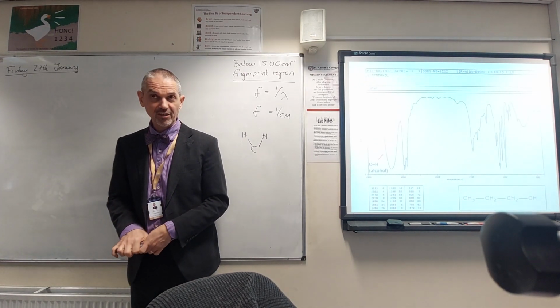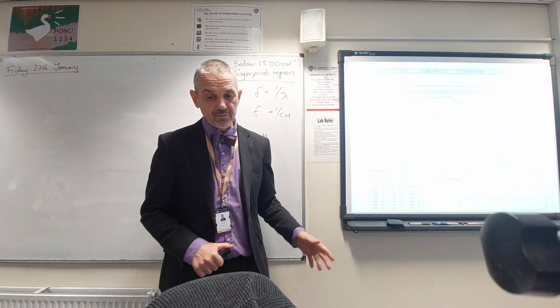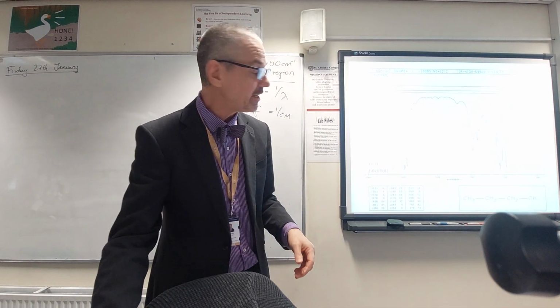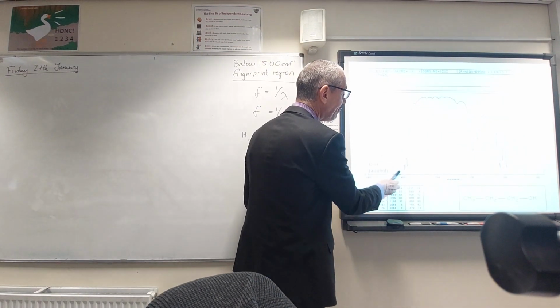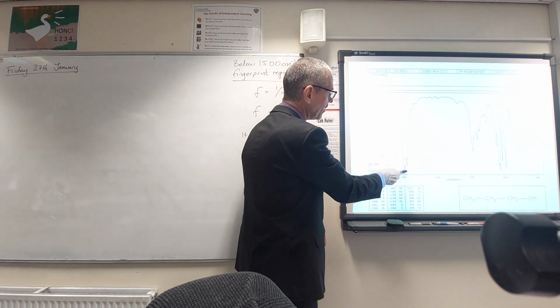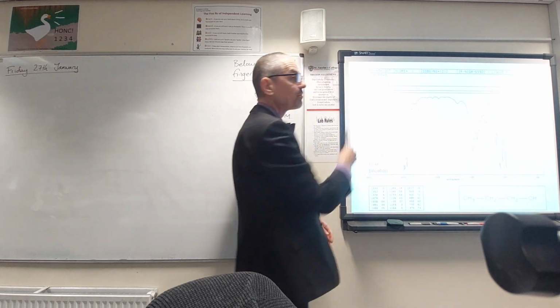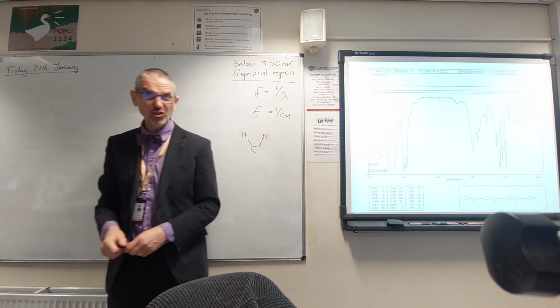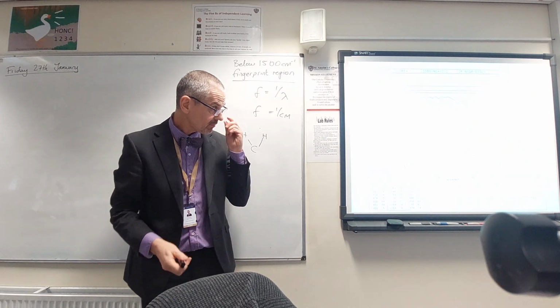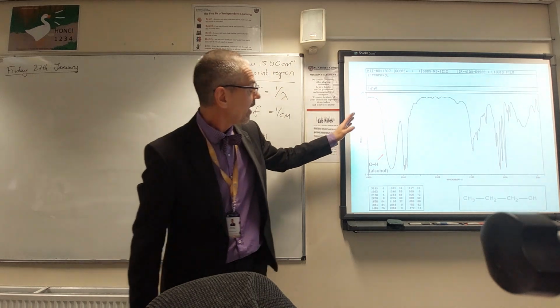And we'll start with OH alcohol. Whatever it says on here, OH alcohol 3230 to 3550, well, that's well above our CHs. We can see lots of CHs there. We know they're always going to be there, so we'll ignore those. But here is this very new, big, broad, strong peak. Very, very clear. Again, below 1500, there's a whole bunch of stuff going on, but we're going to ignore that.